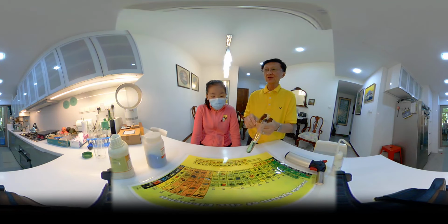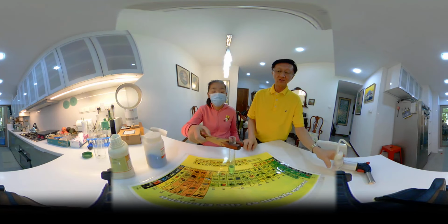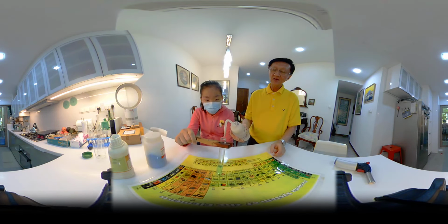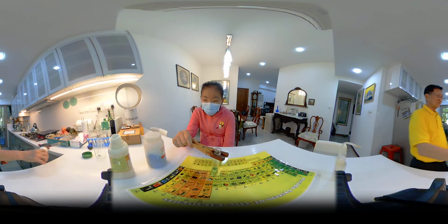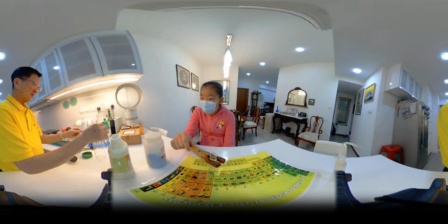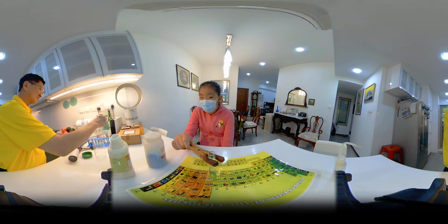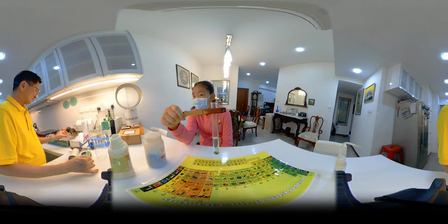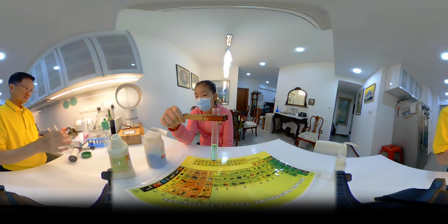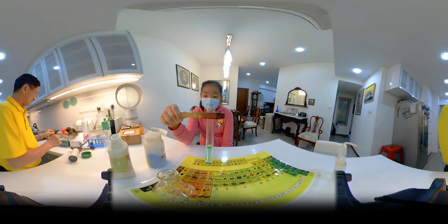Okay? So now you hold on to this. We are going to precipitate out the nickel ion, and we have to set up something like this.